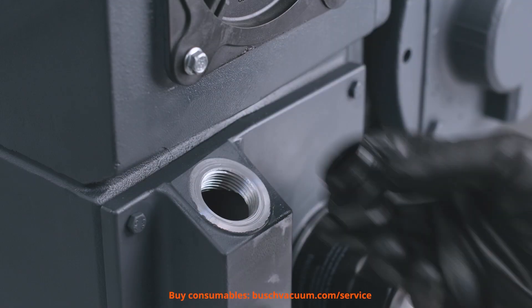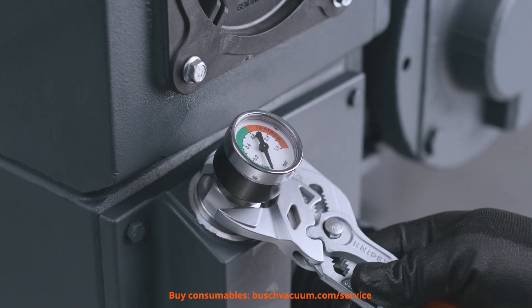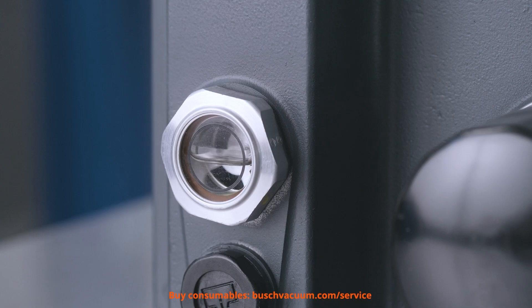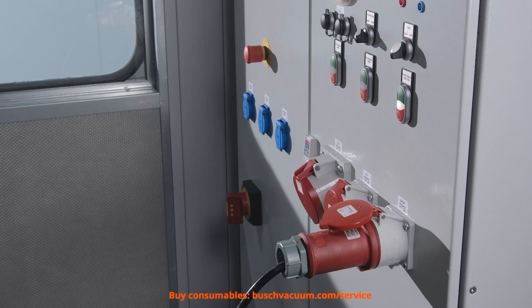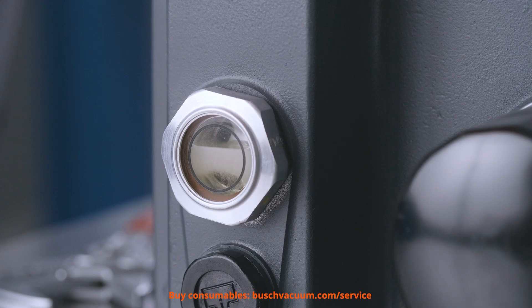Then we screw the filter pressure gauge back in again. It is time to run the vacuum pump. The oil is sucked in and the oil level is sinking. After one or two minutes we can turn off the vacuum pump again and wait for some additional minutes.